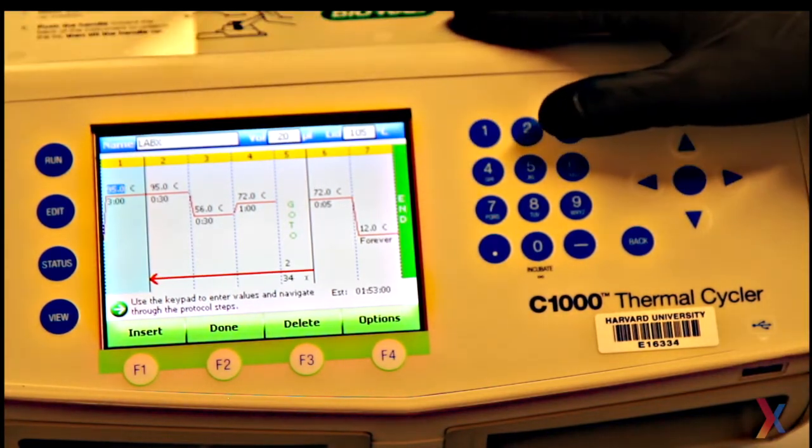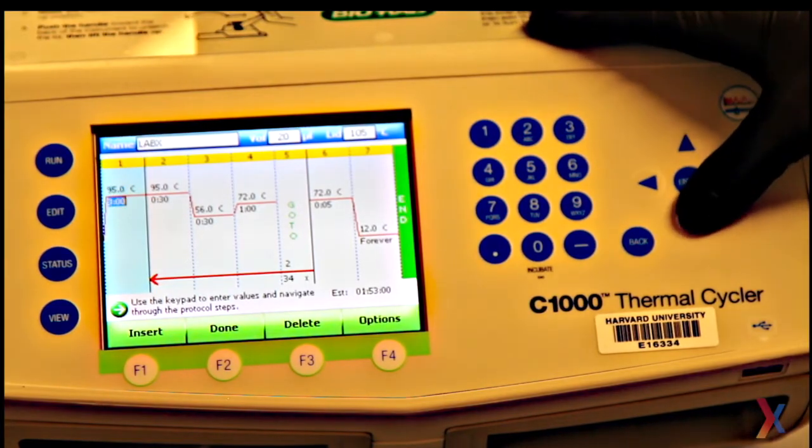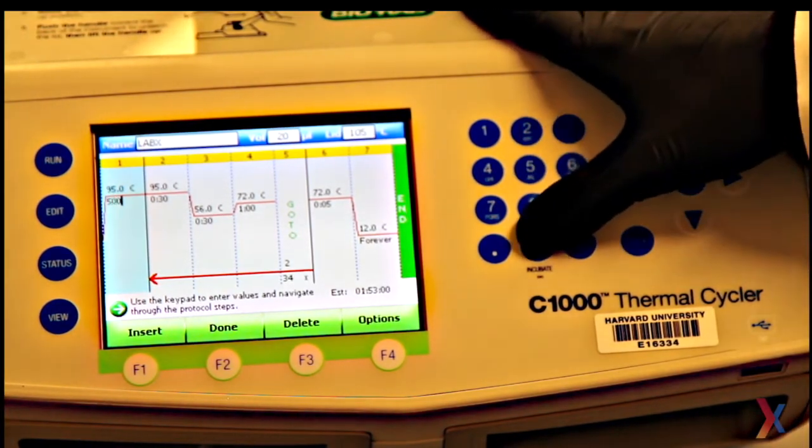So the first step is the initial denaturation step. I want this to be at 95 Celsius and I want this to last for five minutes.